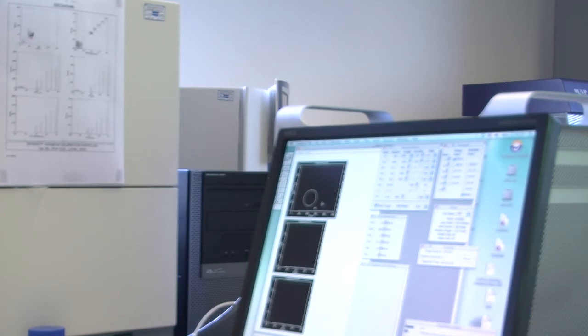So once you've resuspended your pellet in 400 microliters, transfer it to that tube, because that's what we'll use to run it now. Yes, that's good. Don't worry about using the filter. We've not got enough cells to have a lot. So, yeah, just don't worry about the filter. There shouldn't be any clumping at all from what's in it.